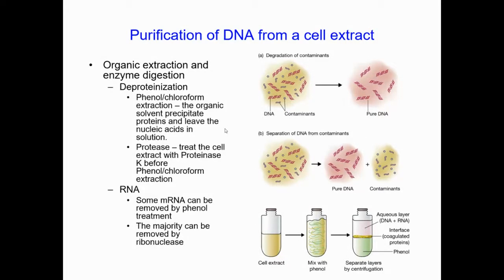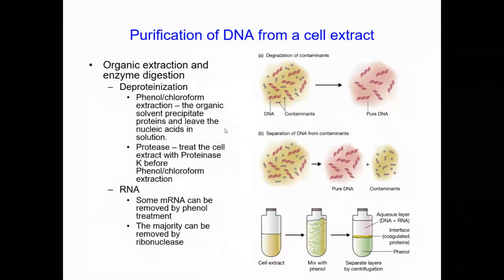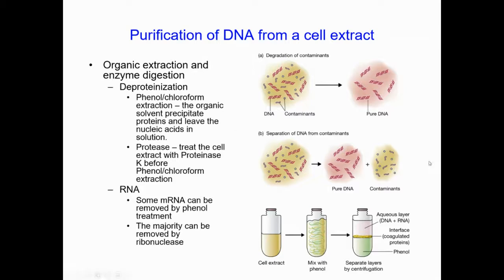Okay, if you mix the supernatant with the phenol, and then apply the centrifugation. After the centrifugation, the protein will be precipitated in the interface between the aqueous layer, which contains DNA and RNA, and the phenol here, right? Phenol being the bottom, right? So that's the phenol. If you apply the phenol and then you mix well and then apply the centrifugation, then you precipitate the protein, and then you will remove this supernatant, the aqueous layer.